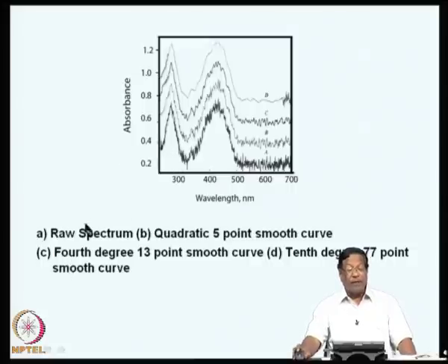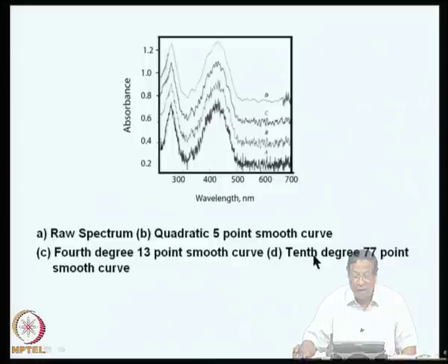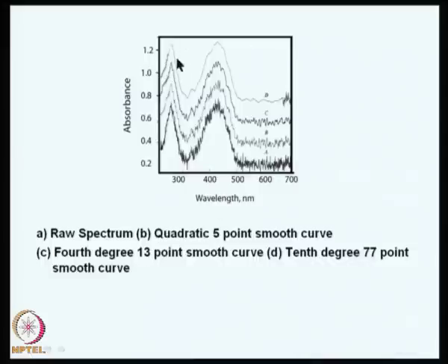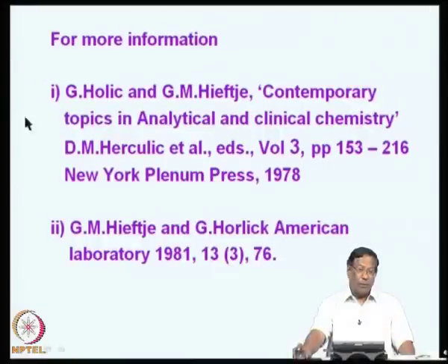Now, you can see figure A is the raw signal, the raw spectrum, and figure B is a quadratic with 5-point smooth curve. Suppose we increase it to 4th degree, then you can see it here like this. The signal is still better, and suppose you increase it to 10th degree, 77-point smooth curve, it will give you a beautiful signal like this. So, computer programs will also help in smoothing out the signals.